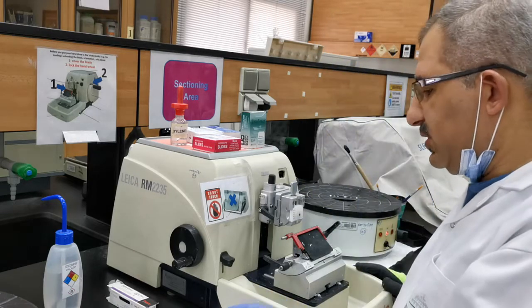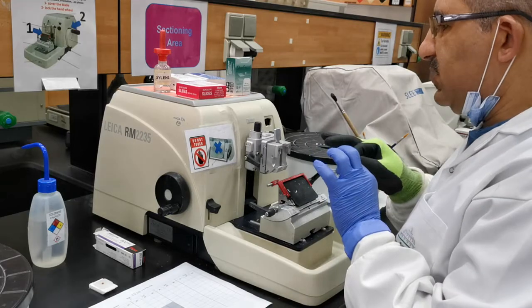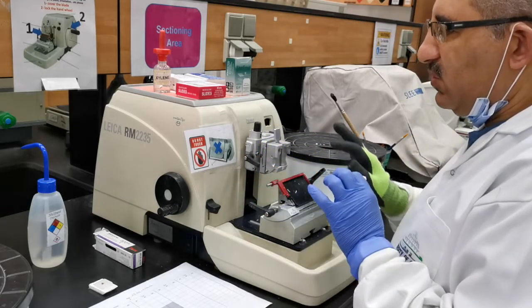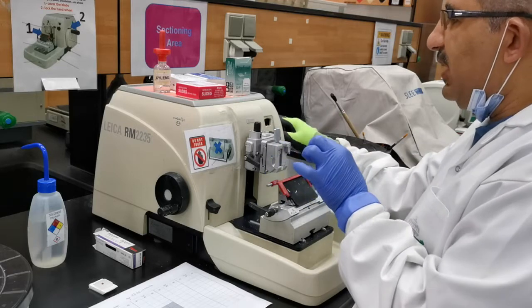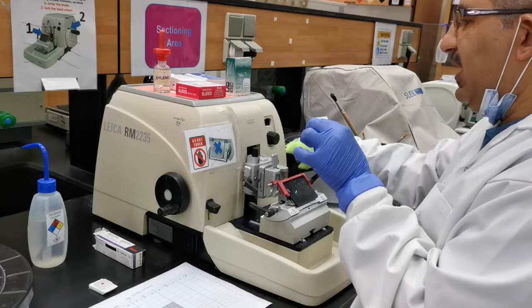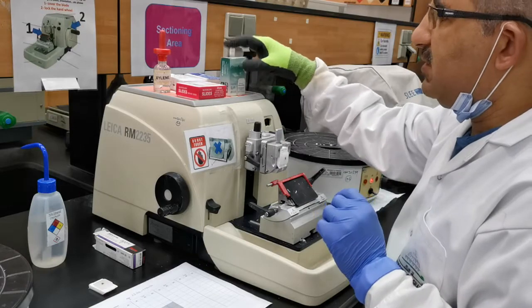The block was placed on a cold plate. I'll remove the demonstration block and use this one. Before I place it, I need to check that the knife is covered, and also I need to check that the wheel is locked. You don't place the block with the wheel unlocked, because while I'm working it might move and squeeze my fingers. So make sure the wheel is locked, then place the block.